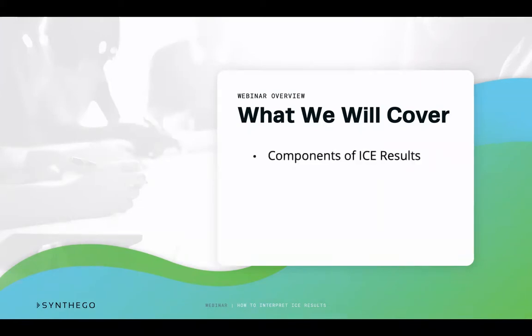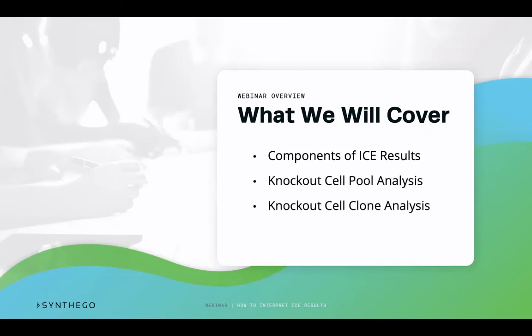Here is what we will cover. First, we will cover each of the various components of ICE displayed after it processes your input files and sequences. These components will allow you to compare edited sequences to other edited sequences and the wild type. Additionally, you will be able to analyze your CRISPR-editing efficiency observed in the sequences. We will then transition to discussing what a knockout cell pool and a knockout cell clone analysis look like when uploaded to ICE. We will finish by understanding what sets a knockout cell pool apart from a knockout cell clone. Remember that you can download a PDF copy of the full slide deck to follow along and take notes during this webinar.